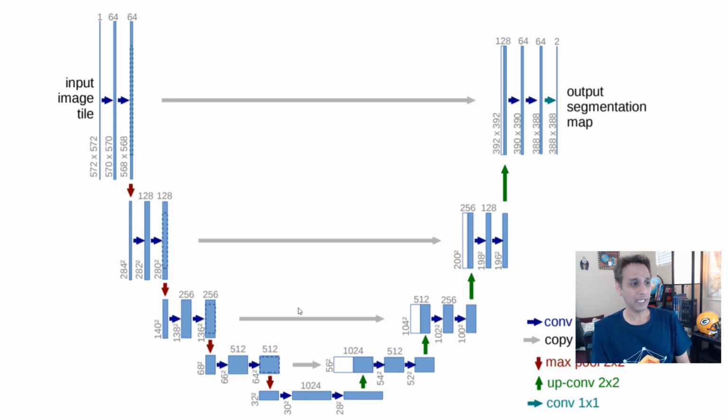And while we are doing this, we are concatenating information from this layer with this layer. You see, graphically it's represented here, and from this layer to this layer and this layer to that layer, right? And why is this better? Again, I briefly talked about this in my video number 73, and of course go ahead and read this paper. Now, in between you can see these operations of convolutional 3x3, ReLU, and max pooling and so on. So this is the architecture for UNet.